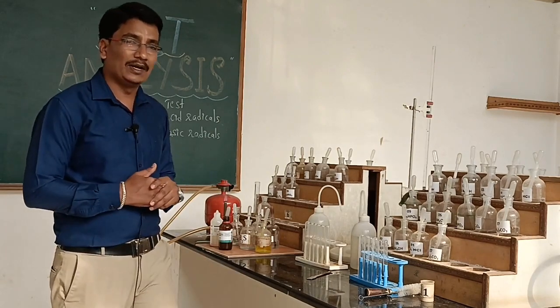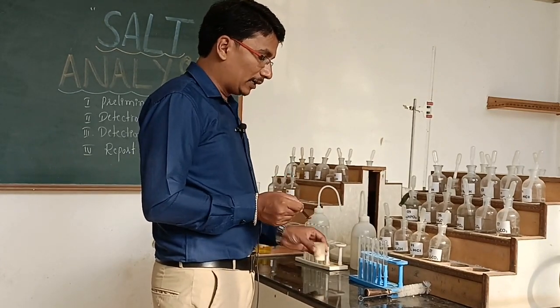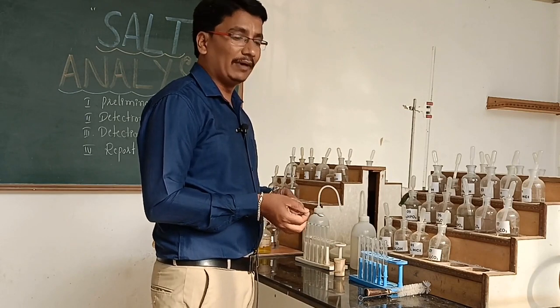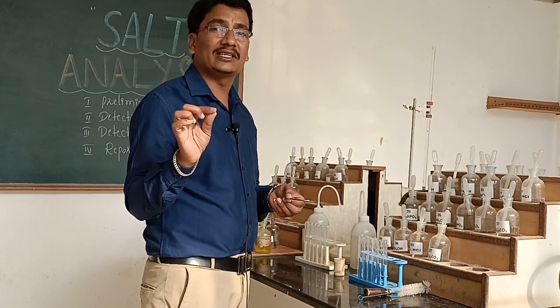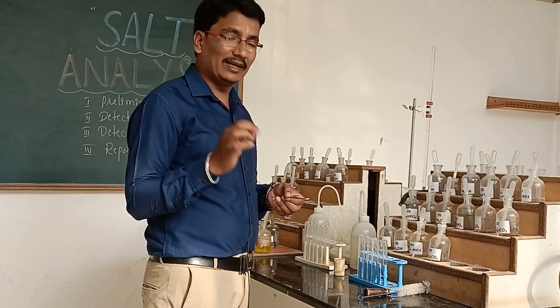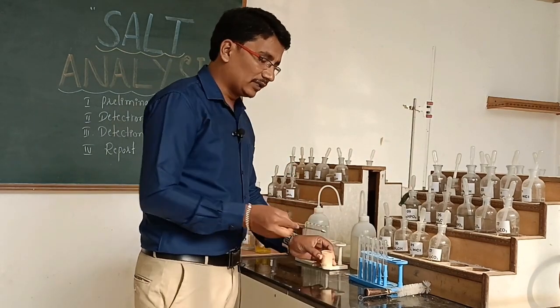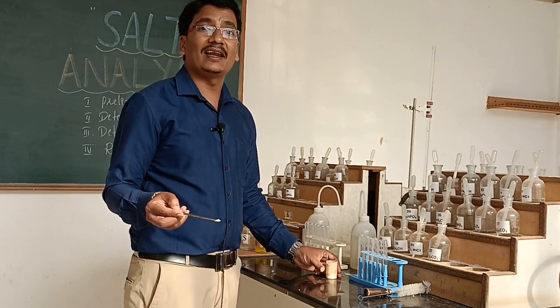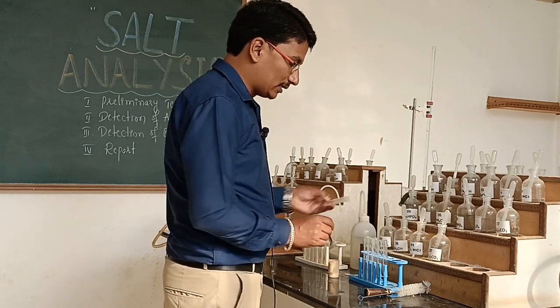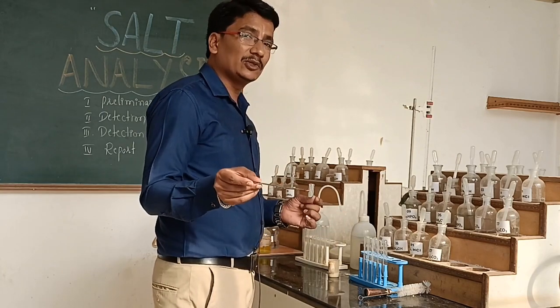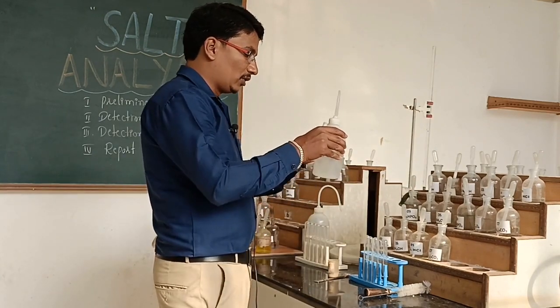I would like to analyze Salt 1. In the beginning we have to state the condition of the given salt. We can see that this salt is in a crystalline state. The color of the salt is white — we have to say it is a colorless solid. Third, we observe solubility: we take 0.1 gram of salt in a test tube, then add water to observe the solubility.